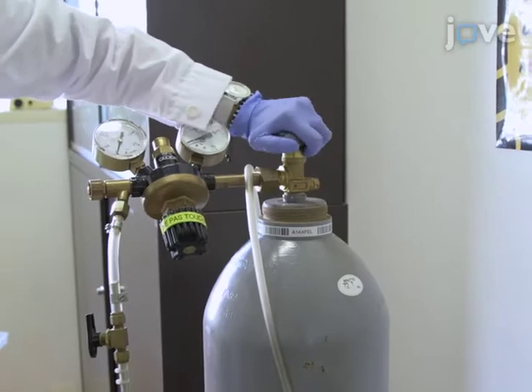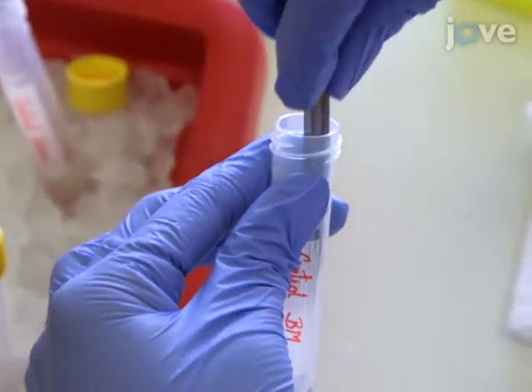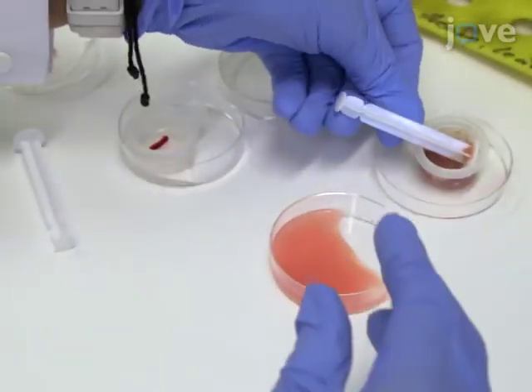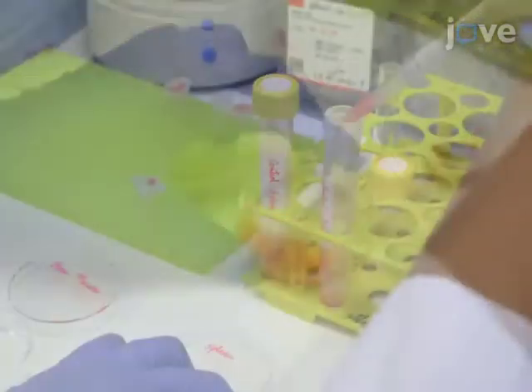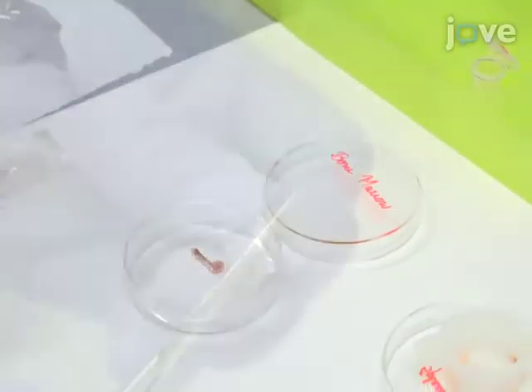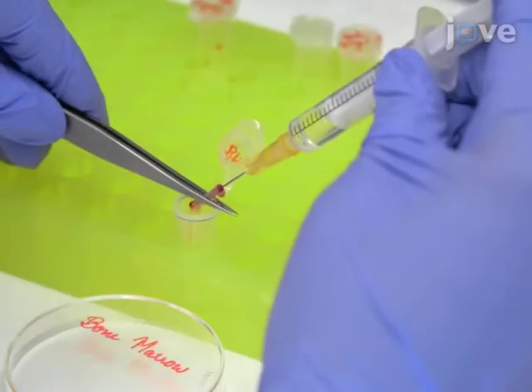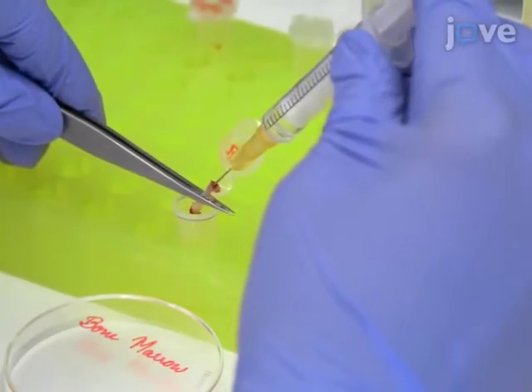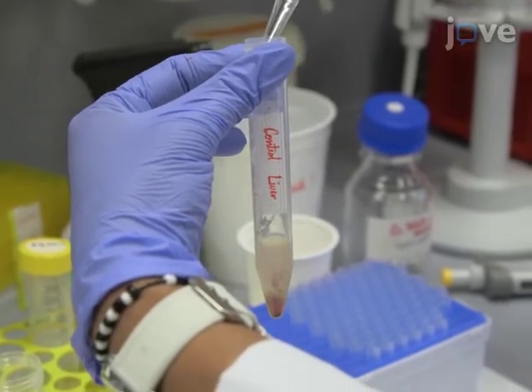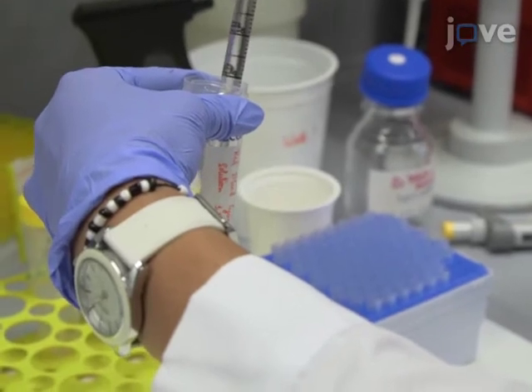After sacrificing the mice in a carbon dioxide chamber, collect the different organs. Then, subject the organs to mechanical disruption on a 70-micron filter with the back of a syringe piston to generate single-cell suspension. Centrifuge all of the samples, except blood, between 400 and 500 G for 5 minutes and discard the supernatant.